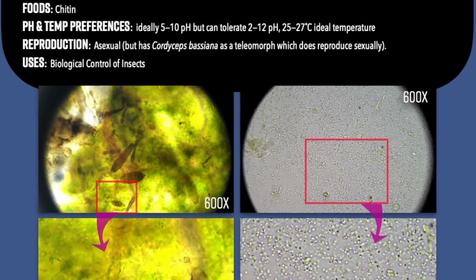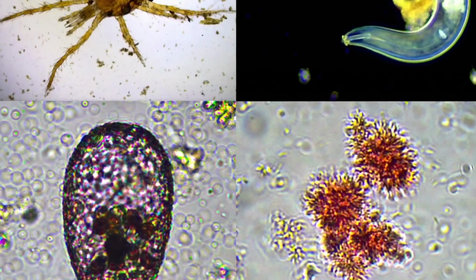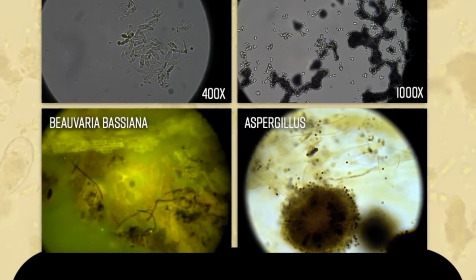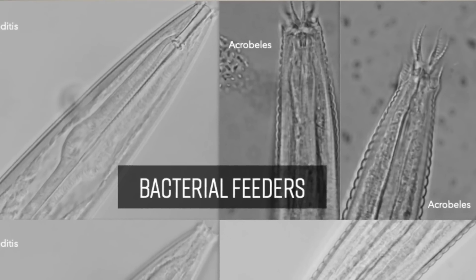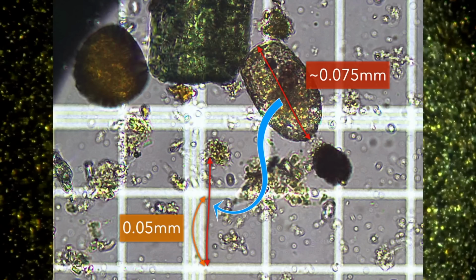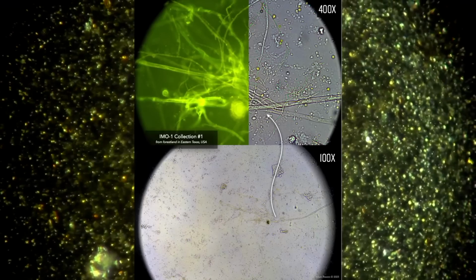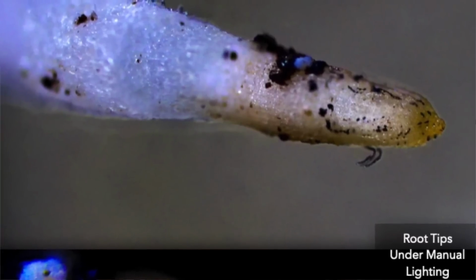If you want to see examples of the fungi and bacteria that matter, the protozoa, the nematodes, the macroarthropods, the microarthropods, all the soil microbes, all the trophic levels, if you want to be able to compare them, you want to look at the mouth parts, you want to look at a gallery of images so that you can sharpen your eyes so that you have a reference of comparison as you travel and explore soil, compost, indigenous microorganisms, even roots and plant leaves.